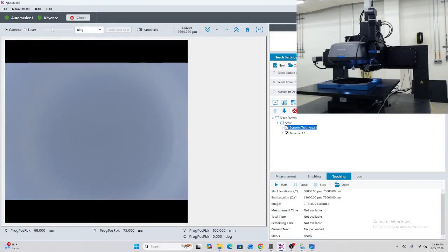Hello and welcome. In this video, we're going to be showing you how we leverage machine vision pre-inspection inside of Peak's XpansionUI software. The Keyence VKX microscope is often the perfect measurement tool for surface applications. It historically required the user to program measurement locations in advance or to manually drive to each area of interest on the surface. Peak is now offering the ability to automate the identification of measurement locations to free up the user and to remove the costly need for automated optical inspection on a separate machine.